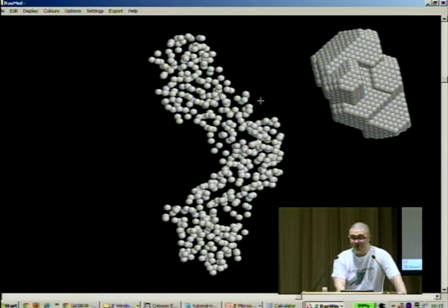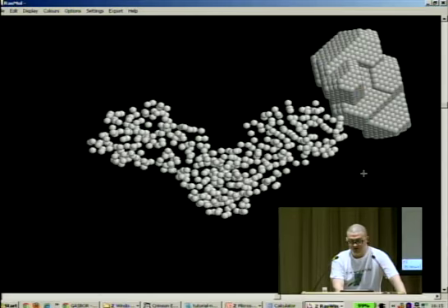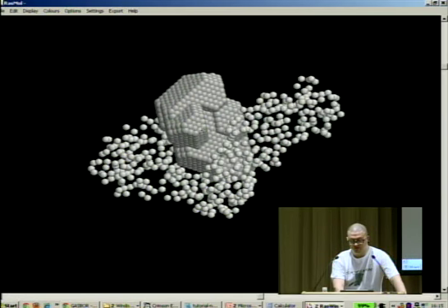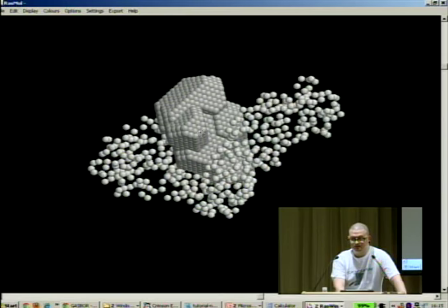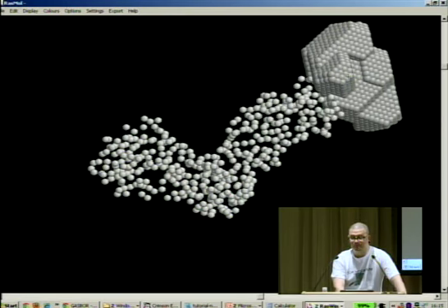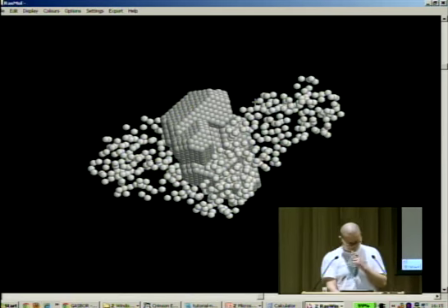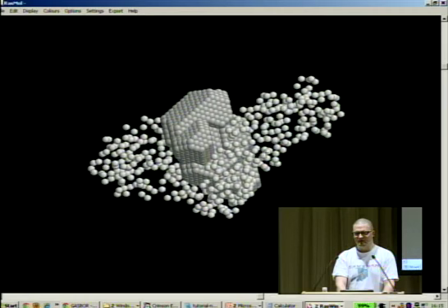So knowing that the radius of gyration didn't change, would you assume that they form a complex like this, or rather like this? So who is for this type of complex? Okay, either you are asleep or you learned everything very well. So who would prefer this type of complex? Okay, everybody is still awake. Good. So this is already, we do not have to do any modeling.